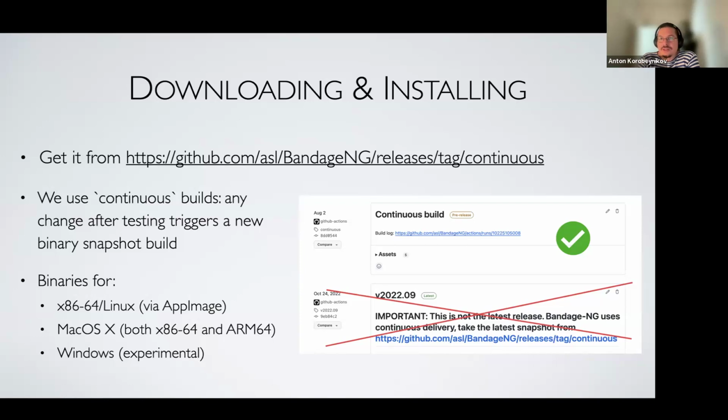So we covered all the major platforms. And if someone wants anything else, feel free to compile from sources and do whatever you want. It's open source after all. But as I said, I try to do my best to ensure that all these binaries will be available, and because they're built automatically, you just go and download them.